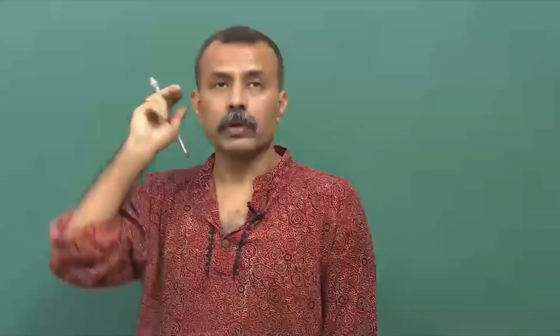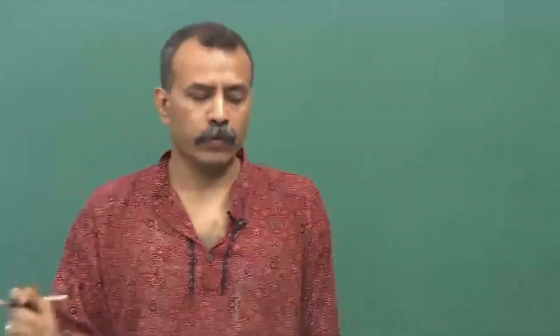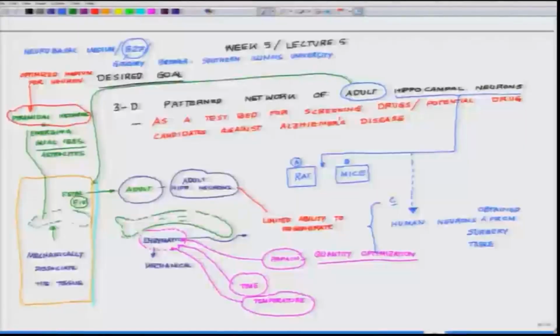the growth of especially the hippocampal neuron and other brain neurons. And you have to supplement. So, neurobasal is buffered using sodium bicarbonate, okay, sodium bicarb buffering. So, you have to use the CO2 incubator, and most CO2 incubators prefer 5% CO2 for embryonic hippocampal or any of the hippocampal neuronal culture.